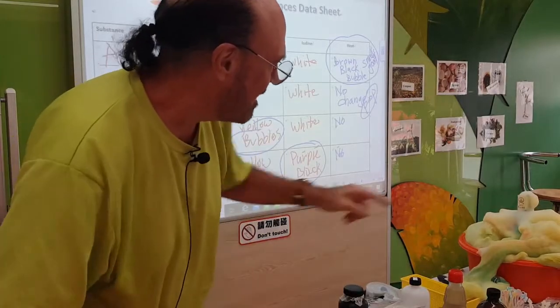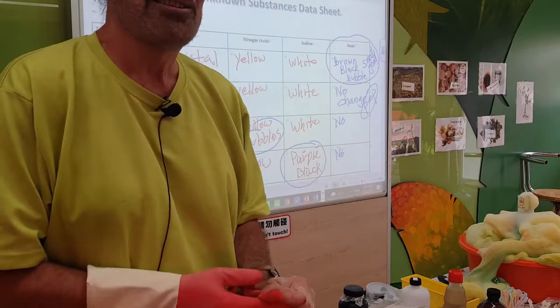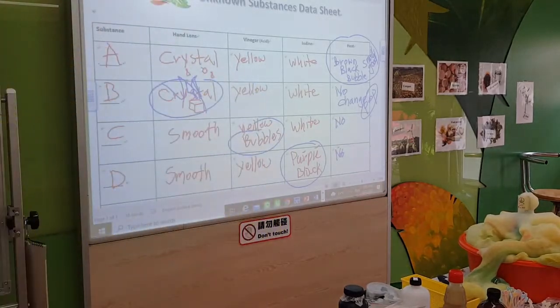What a mess. Look at it. I almost stayed inside all of it. Just a little bit outside. I was lucky. Sometimes it shoots to the ceiling.